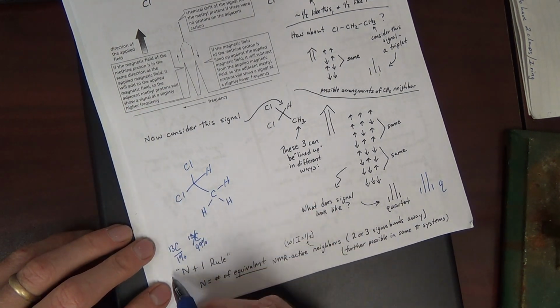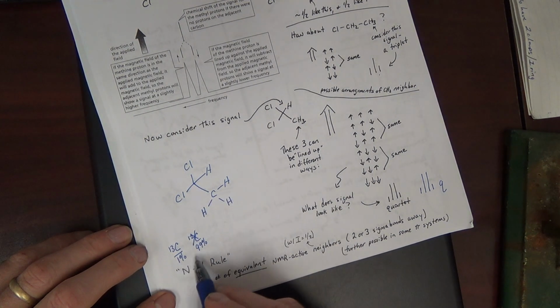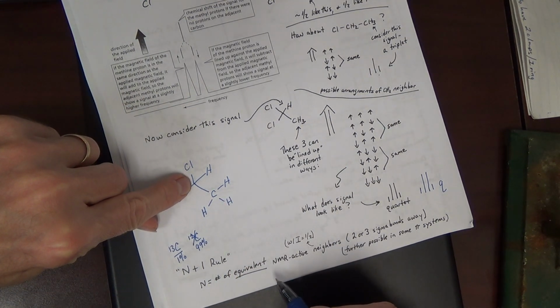If that was carbon-13, it would split the signal. But it's so unlikely for that to be a carbon-13 that we just do not see splitting by the carbon, nor by that carbon.